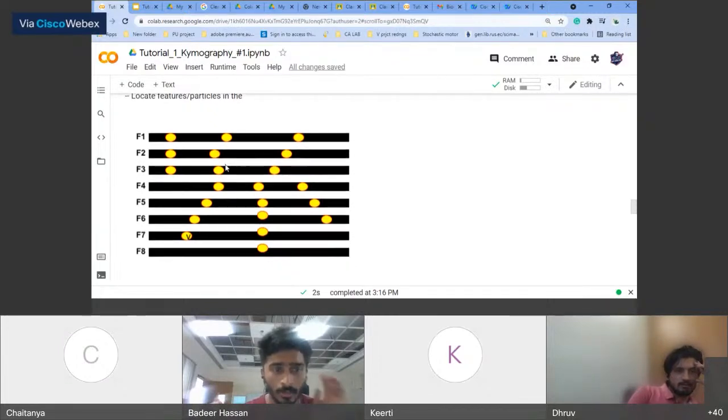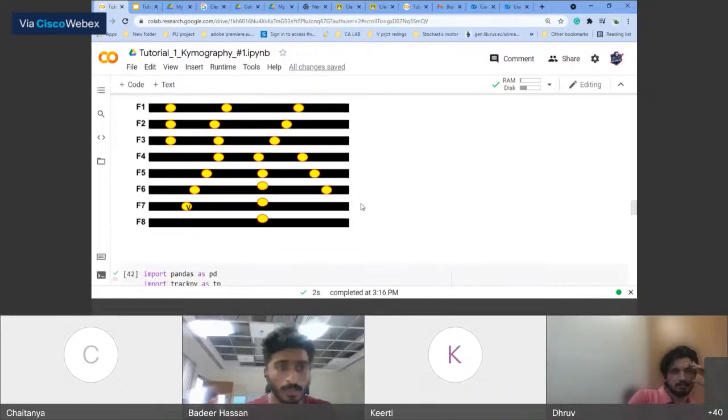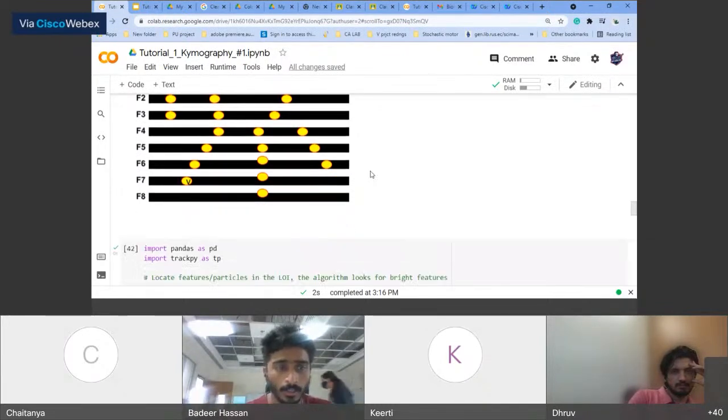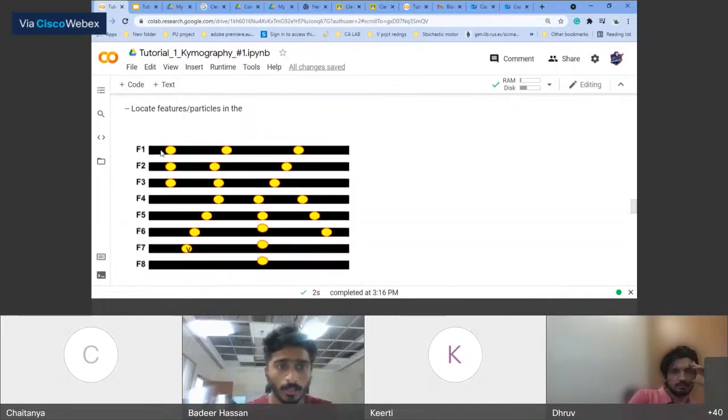From just observing this data, we can see that by connecting these, we will get the axial trajectory of the particle across different time frames. So the next step for the algorithm is to link the trajectories using the data we have created now, the position of the particle data here.